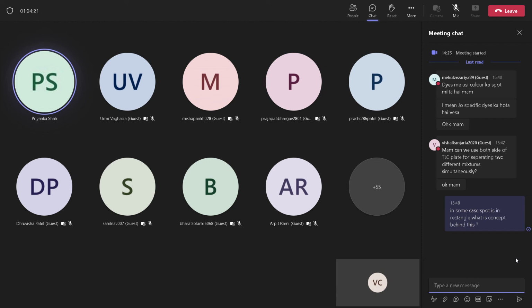Then after performing TLC, you have to do UV analysis. Then you have to perform NMR. Then you have to perform IR. And for all these studies, if you get similar results as you are getting with the library, then you can confirm this unknown compound is exactly the same as we have initially matched in the library. Okay.